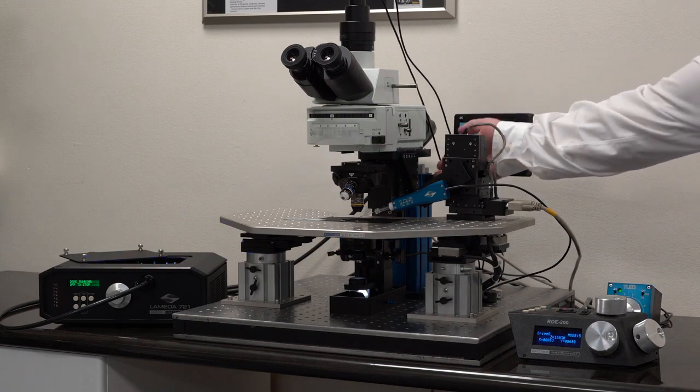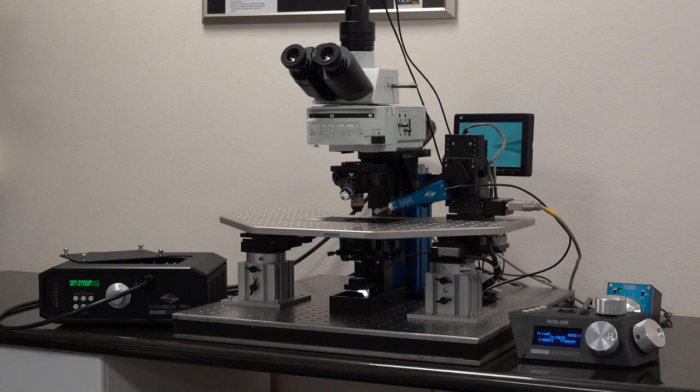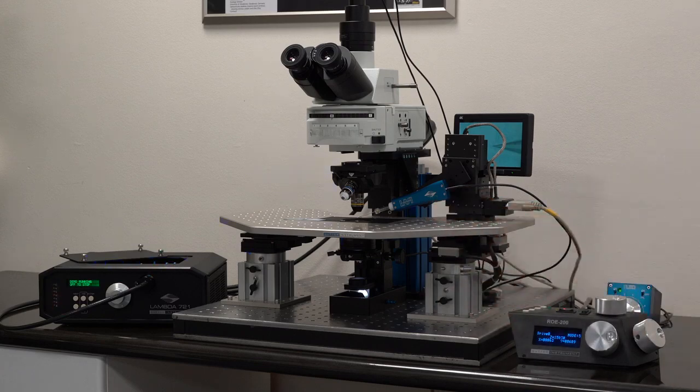You'll notice that the microscope frame has been replaced by a blue rail. This blue rail is the same extrusion that we use for our MT75 gantries and also our motorized stage.